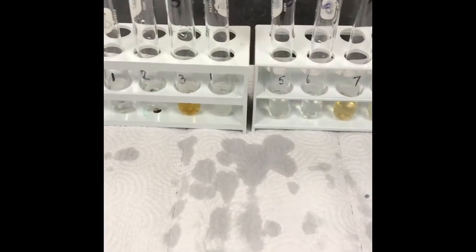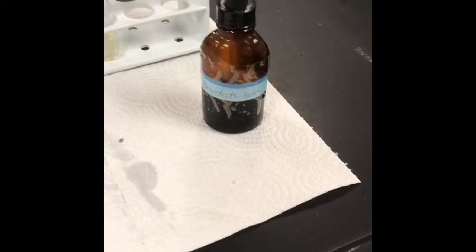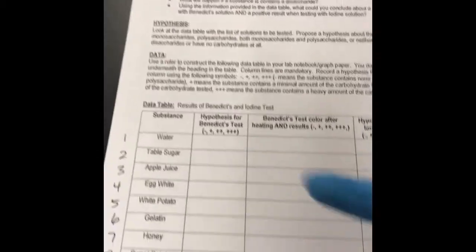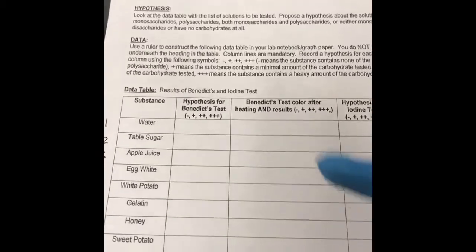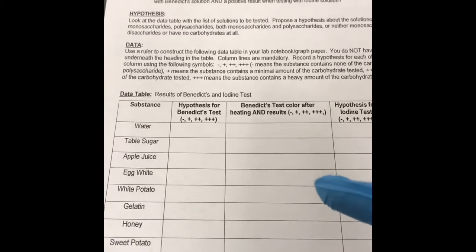Now we're ready for the next test, which is called the Benedict test. We're using a reagent called Benedict's solution. This is going to correspond with your data table in this section. Before we get started, I would like you to go ahead and record your hypothesis. You did the other one for iodine over here. This one, I want you to record negative if you think it does not have any monosaccharides or reducing sugars, and then a 1+ if you think it has a minimal amount of monosaccharides or reducing sugars, a 2+ for medium, and a 3+ for heavy.